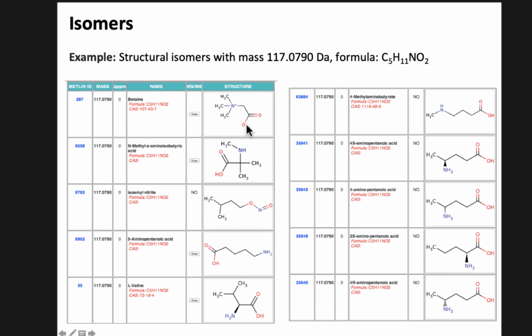Now, if you have done organic chemistry, it's pretty clear to you what's going on. You have all these functional groups, and you can just rearrange them on the scaffold in any way you like. You move the methyl group left or right by 2 positions, you get a new structure. And oftentimes it's actually hard to distinguish these structures because they can have and will have very similar fragment spectra.